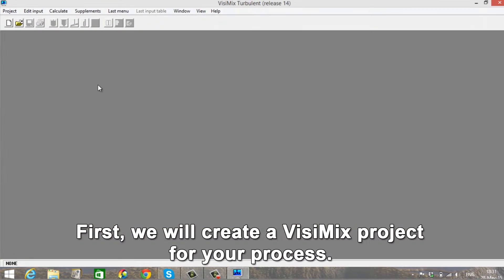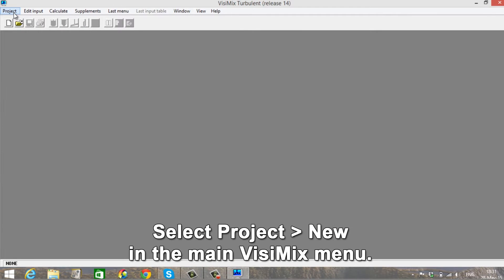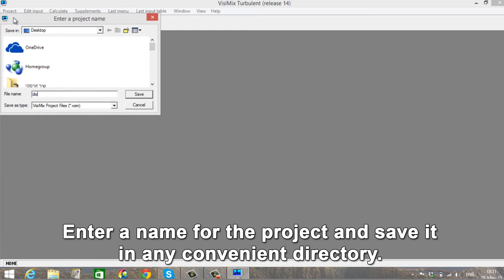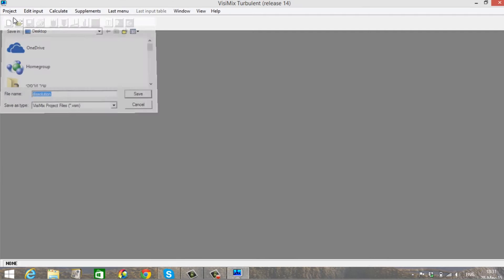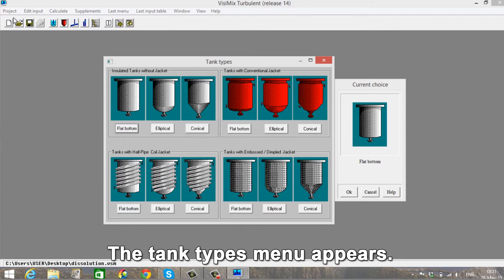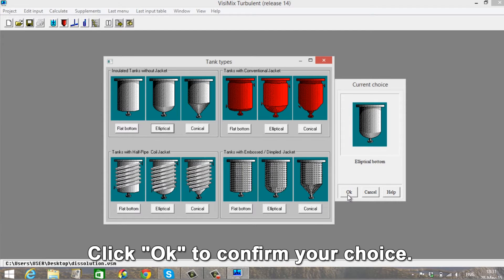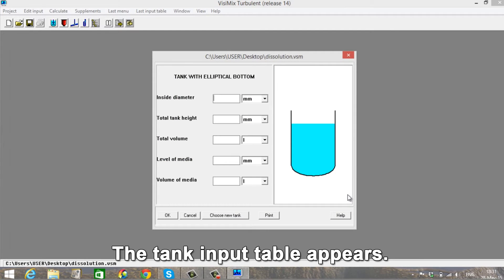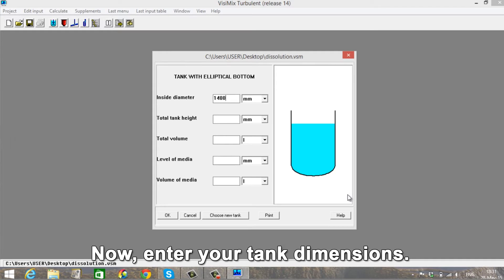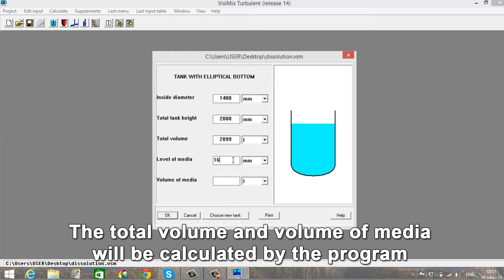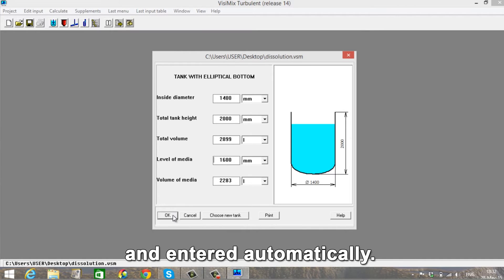First, we will create a Vizimix project for your process. Select Project in the main Vizimix menu. Enter a name for the project and save it in any convenient directory. Click OK. The Tank Types menu appears. Click on the diagram of your tank and it will appear in the Current Choice window on the right. Click OK to confirm your choice. The Tank Input table appears. Now enter your tank dimensions: Inside Diameter, Total Tank Height and Level of Media. The total volume and volume of media will be calculated by the program and entered automatically.